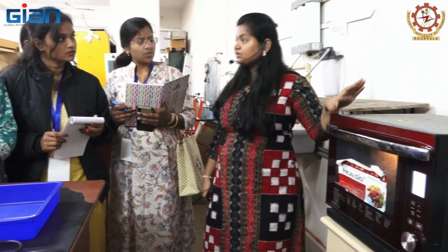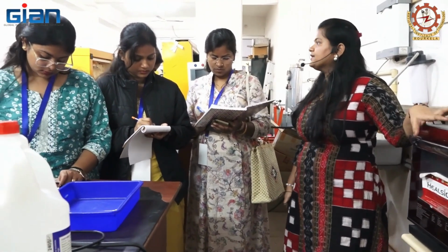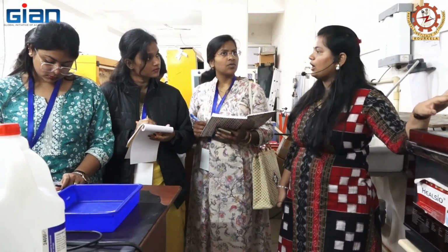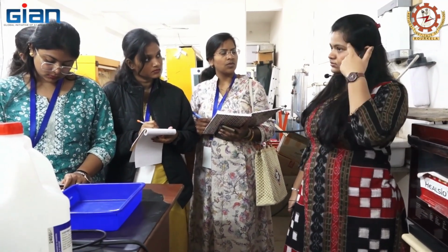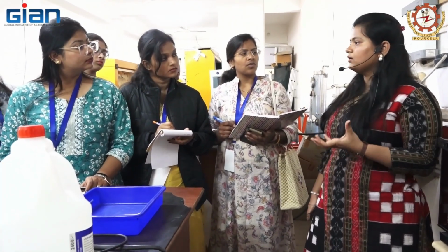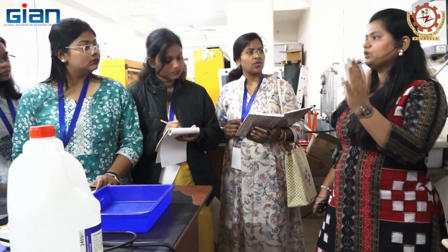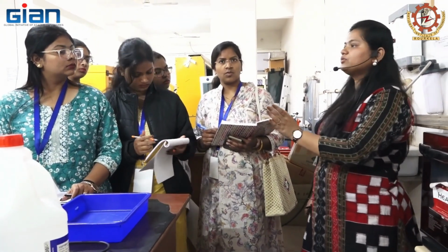Temperature is the biggest factor, because in the microwave the temperature rises from the inside to the outside. Suppose you are heating something on a stirring plate or hot plate. The heating happens first at the outer vessel and outer surface, then slowly goes to the inside.